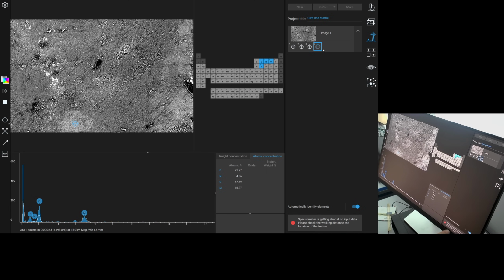Yeah, wrong working distance probably. I know because the sample is 3.9 millimeters high and your tray is 4 millimeters deep. The granite is the closest. It's possible, but not ideal.